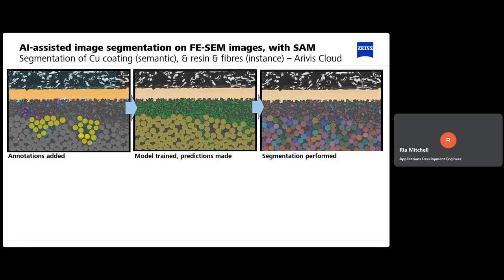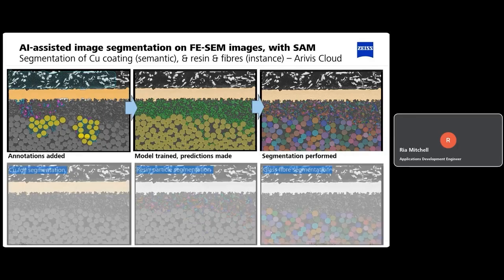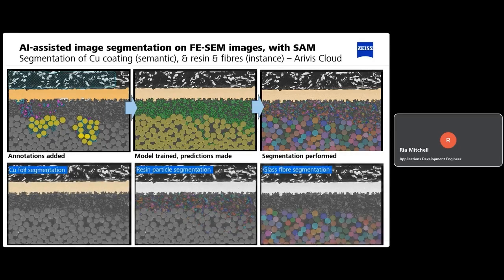And then, of course, once we're happy with it, we can let that model run, and then we can segment it for our whole data set. And that's not all. As Andy mentioned, we're able to do instance-based segmentation.